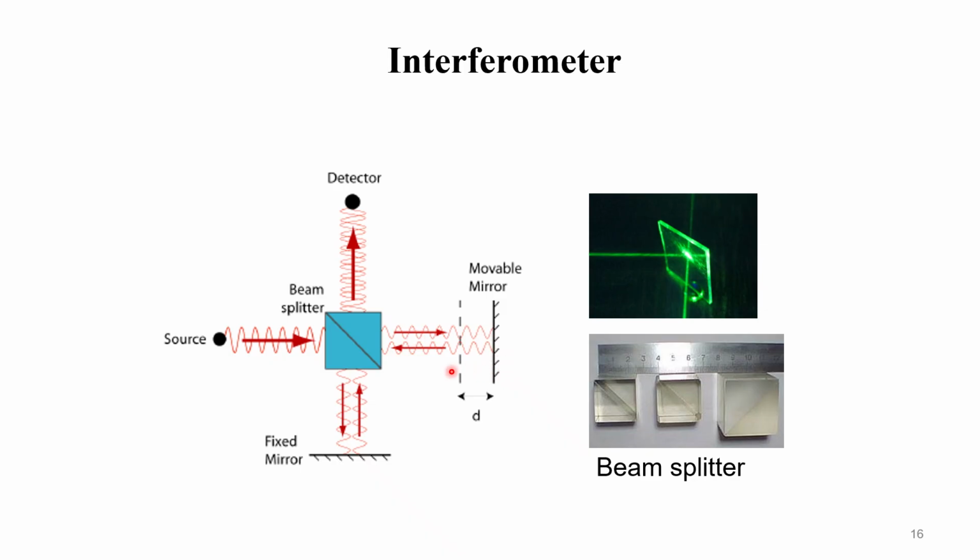The beam splitter is the important part of an interferometer. In its most common form, it appears as a cube made from two triangular glass prisms which are glued together at their base using adhesive. The thickness of the resin layer is adjusted such that half of the light incident through one port is reflected and the other half is transmitted due to frustrated total internal reflection.